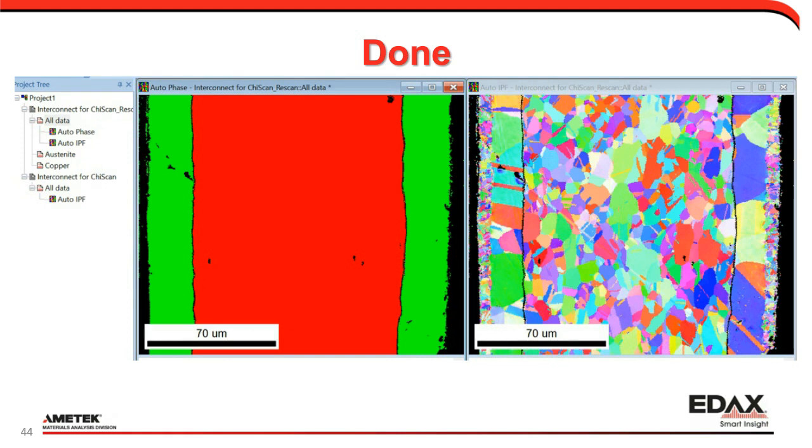In this case, again, the lattice parameters are also. On the right is going to be my IPF map. Honestly, in this case, there's no real change to my IPF map because the lattice parameters are so much the same. There'll be slight variations, but very, very little. In the end, we have our done map, and that's our goal here. I now have usable data that I can say, okay, these phases are better differentiated because of the chemistry.